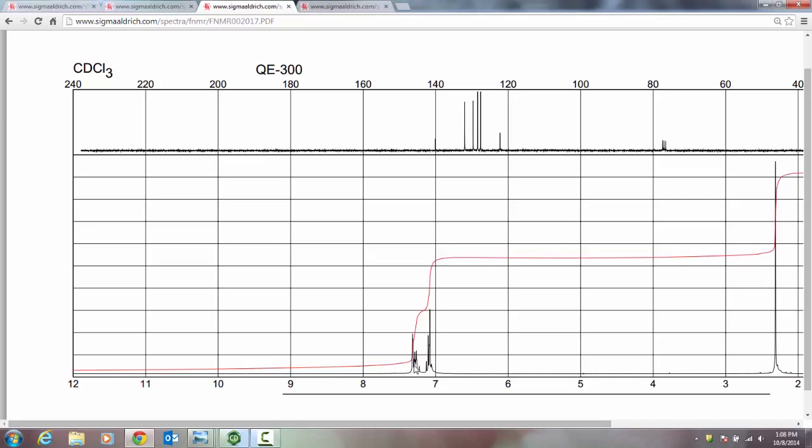What we have in here is a mess. But you have a doublet in here on top of a doublet. So it's kind of ugly, but that's what we have, a doublet on top of a doublet. There is a triplet that is underneath a singlet in this case. So I know that's ugly, but this is reality when you're looking at spectra, which is why you oftentimes want to look at more than one type of evidence to try to figure this out. They're often on top of each other.